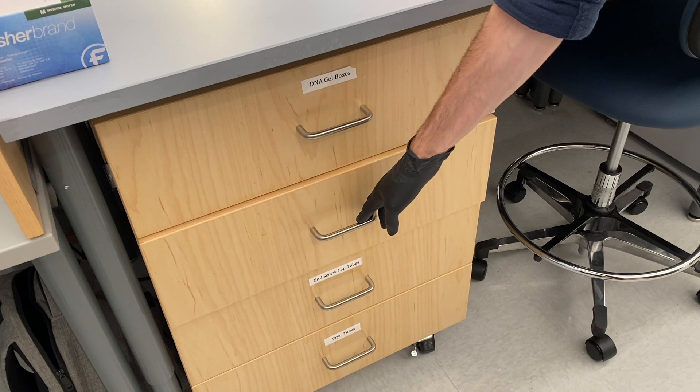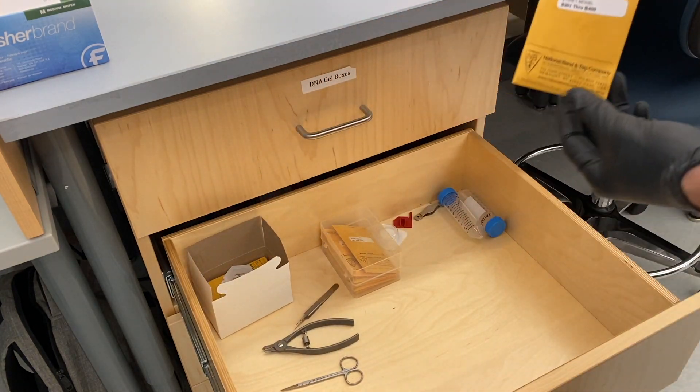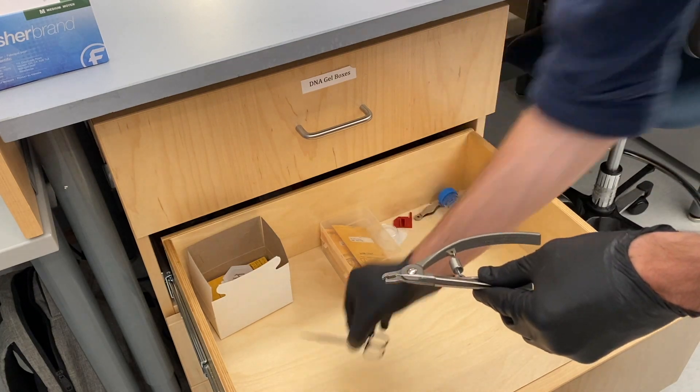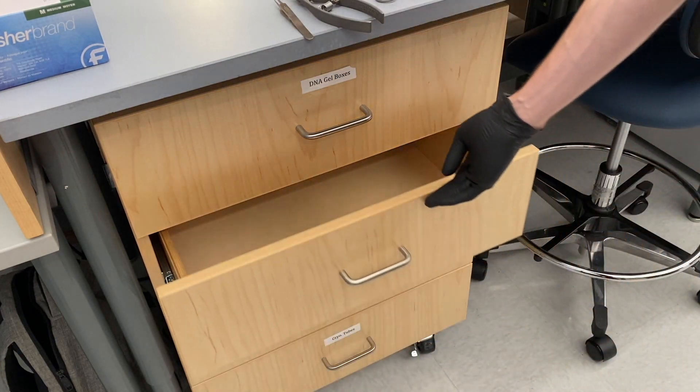The ear tagging tools can be found in this drawer. These tools include the tags, forceps, the pliers to apply the tags, and scissors to take the ear snips. You can see these tools here.